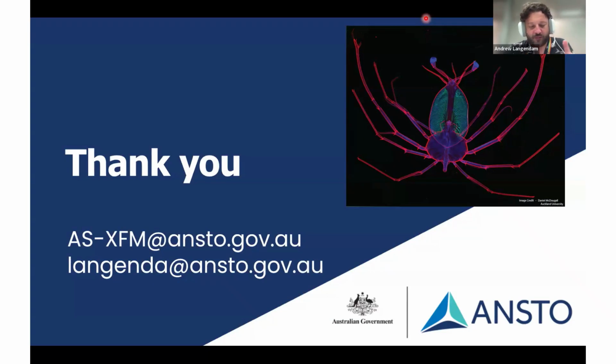The one big thing that does affect your ability to get good maps out of XFM is the types of slides you're preparing your samples onto. In that case, you want to have slides that are very, very clean. We recommend looking at things like electrically fused quartz. There's a set of slides from SPI, which are electrically fused quartz that we would recommend. We've had very good experiences with.